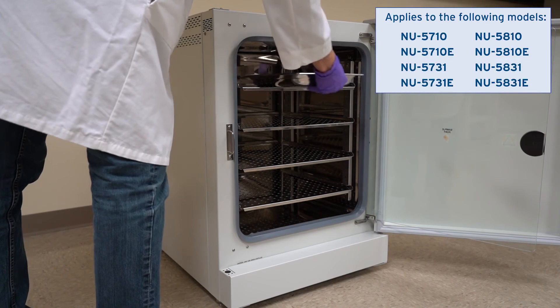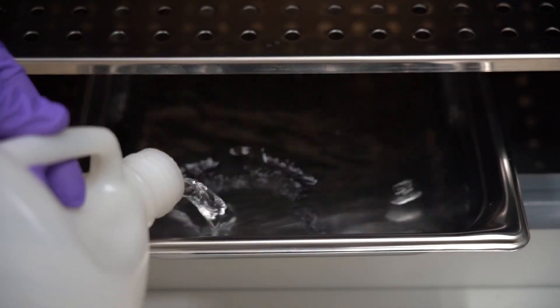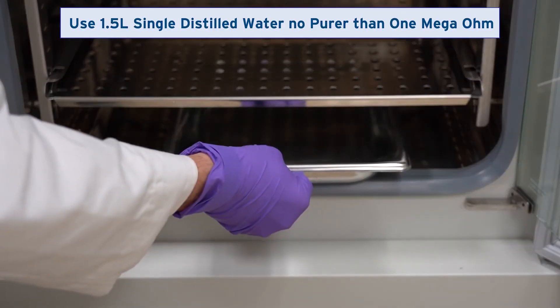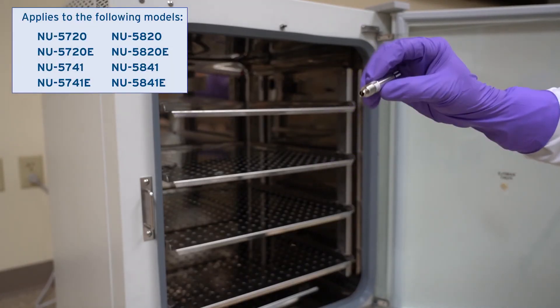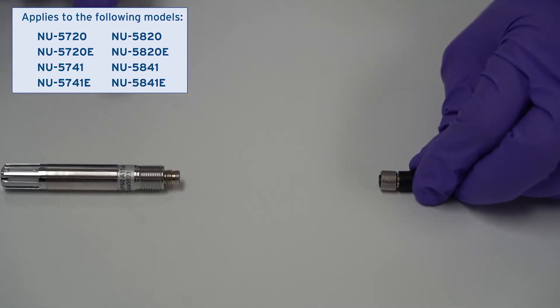Place the water pan at its usual place in the bottom of the chamber. Refill the water pan with single distilled water, no purer than 1 megaohm. If equipped, carefully observe the process shown to safely reattach the relative humidity sensor without damaging it.